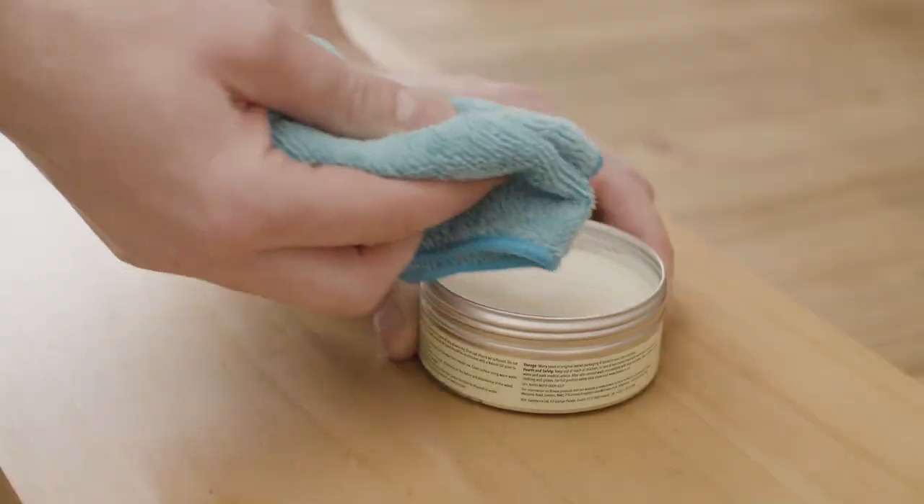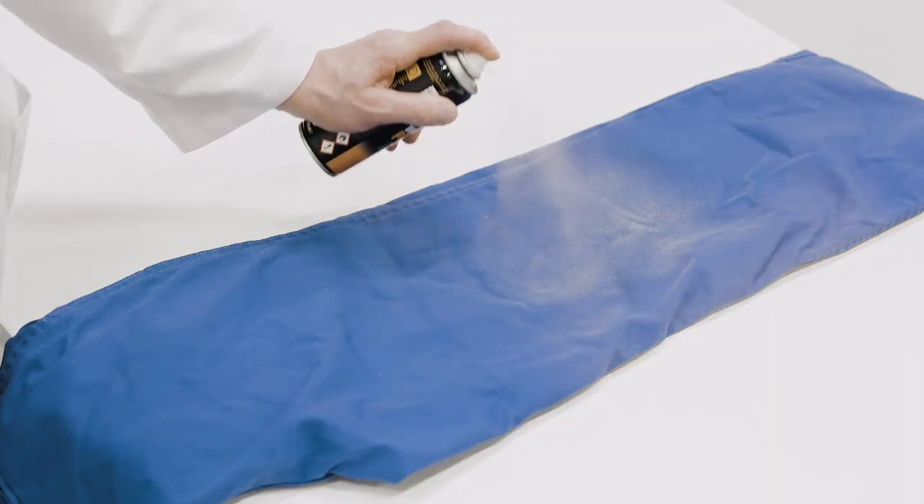In this video we're going to demonstrate how a high-speed Silverson mixer can be used to make paraffin wax emulsions. They are used as additives or coatings in a wide range of products.